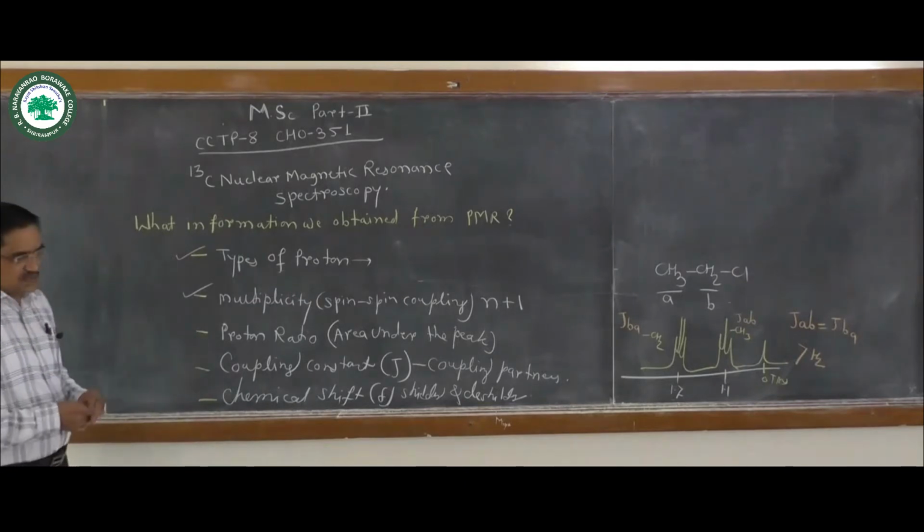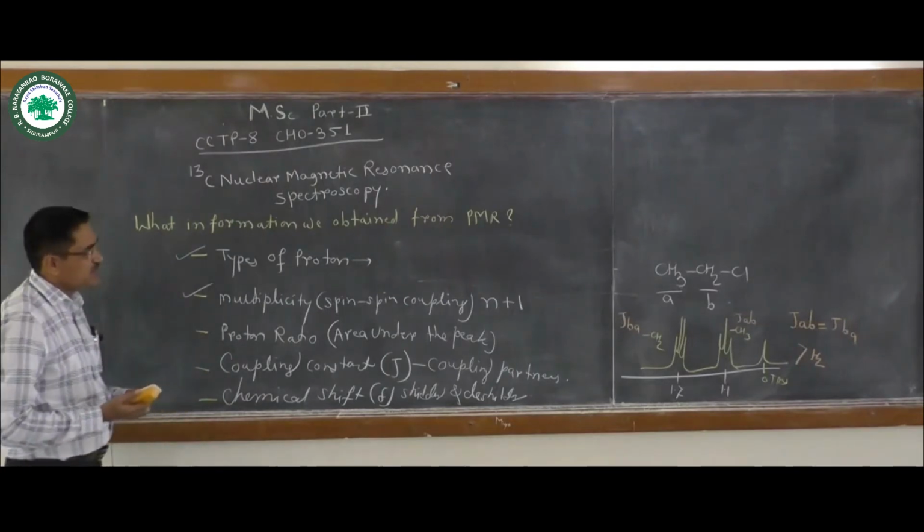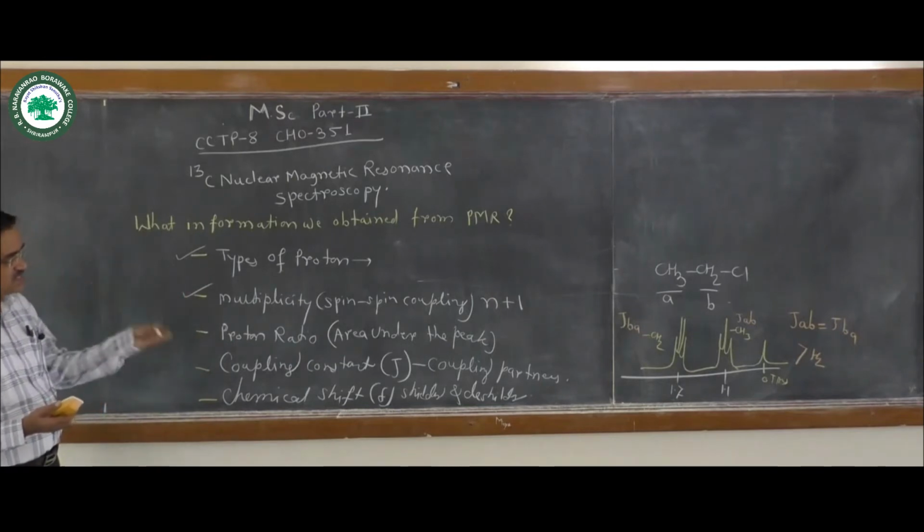Now, when we consider CMR, there are some differences between PMR and CMR.